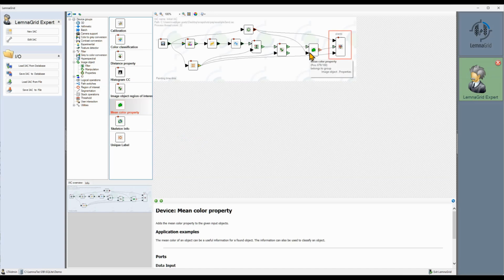However, if you use the usual objects writer, as we do here, only 6 of these values are actually written to the database, the mean and variance of each RGB channel. If the input is a grayscale image, we still get 6 values, but we have only 2 values which are different. Since the original data is grayscale, the mean and variance is the same for all color channels. However, this still can be useful if we need to measure some calculated values with some more complex cameras, like PAM or hyperspectral. We will use this in videos about these cameras in class 4.